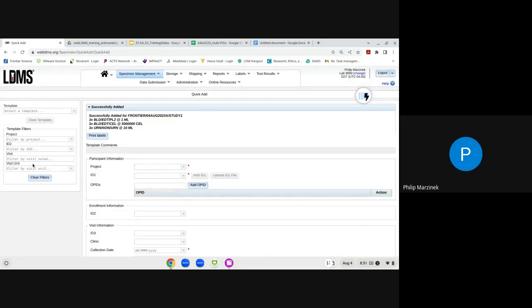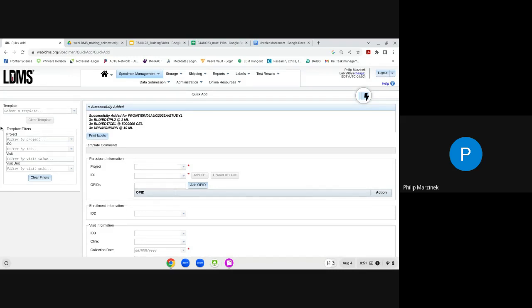To recap the template method: use the project filter to find your template, confirm loading the template data, enter participant ID, ID3, clinic, collection date, receive date, collection time, and receive time. Much less information is needed compared to manual entry. Then click Add and the specimens are saved.